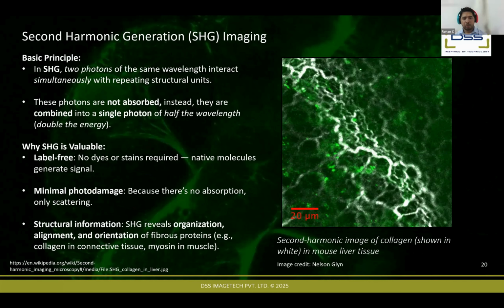Yeah, so in case your laser is mode locked to only give excitation at 800 nanometers, I would suggest you use dyes that are more blue shifted. For example, if it is possible in your condition to avoid using mCherry, and you can continue to use GFP or CFP or YFP, you can achieve efficient excitation of these fluorophores with an 800 nanometer laser. So it is also possible with the same laser to excite a blue dye and a green fluorophore like GFP.